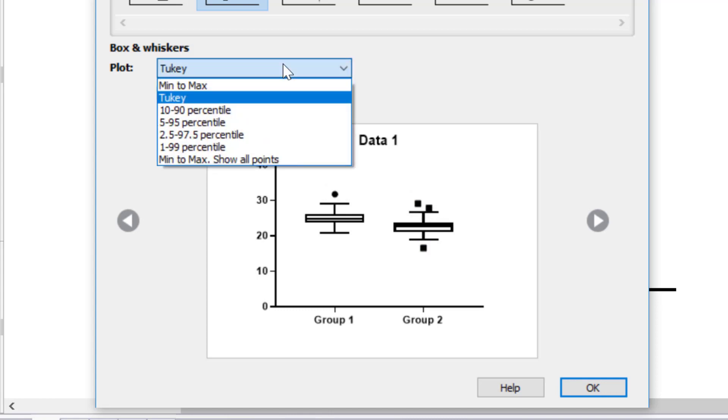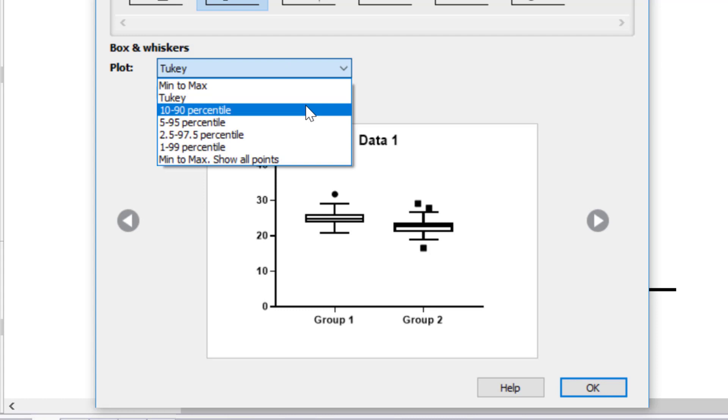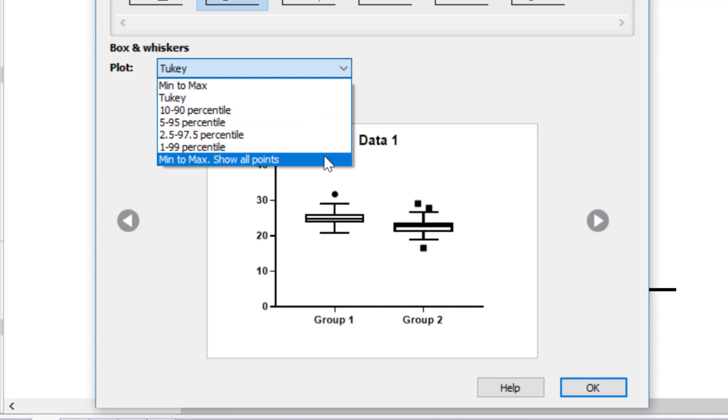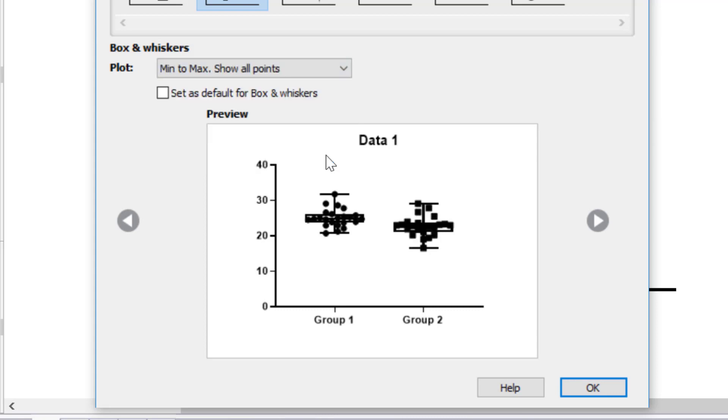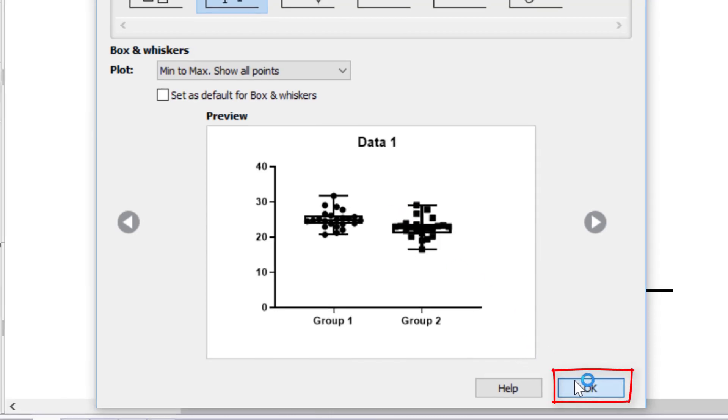Additionally, you can also set the whiskers to be a percentile, so the 10th and 90th percentile. And there's also an option to plot the minimum and maximum values as whiskers, as well as superimposing all of the data points onto the box and whisker plot. So for this video tutorial, I'm going to leave the superimposed data points on top of my box and whisker plot with minimum and maximum whiskers and click the OK button.